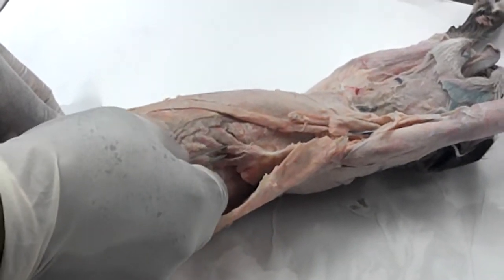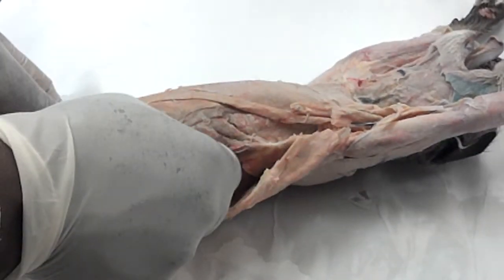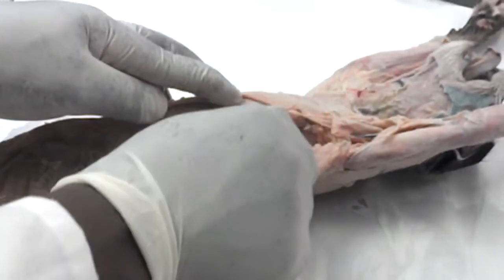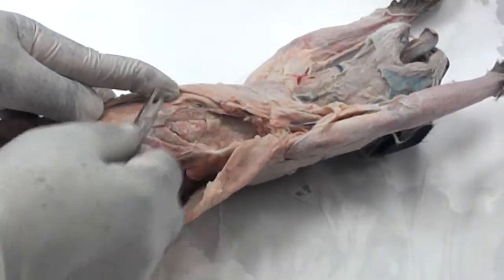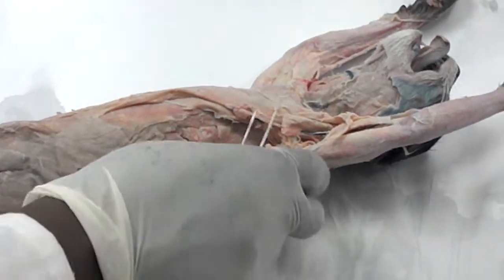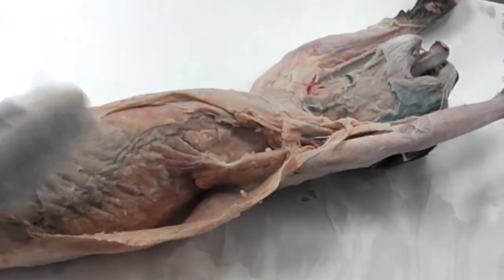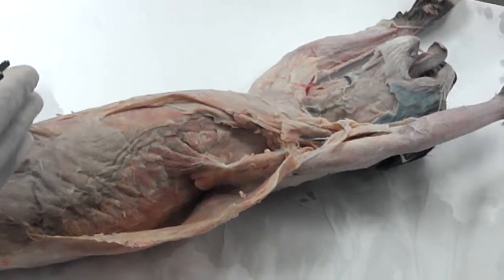We will see these serratus ventralis and scalene muscles. Okay, the scalene muscles, this group of muscles. Right? Now, from here, the best way to identify these muscles around the scapula is to identify the borders.